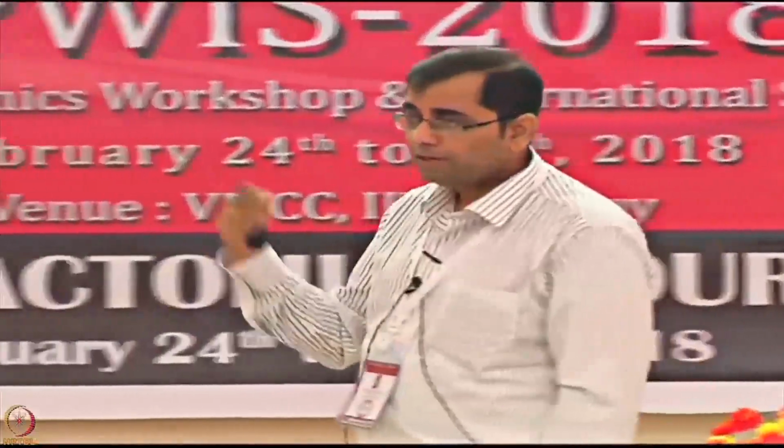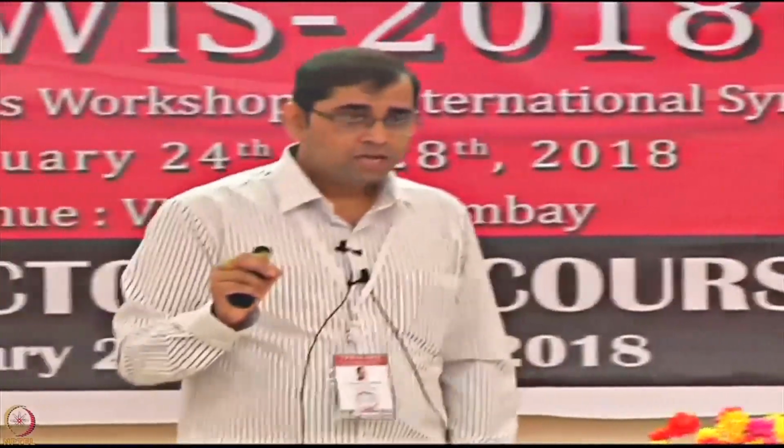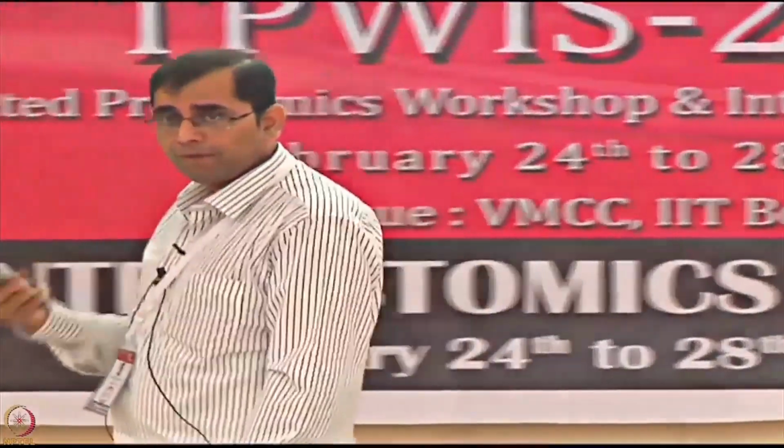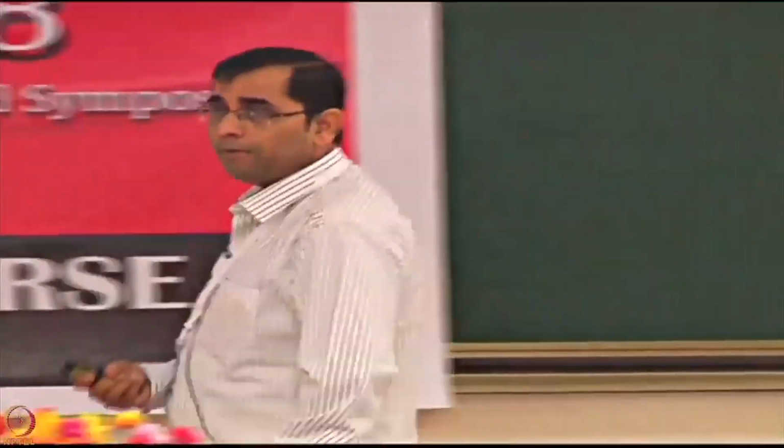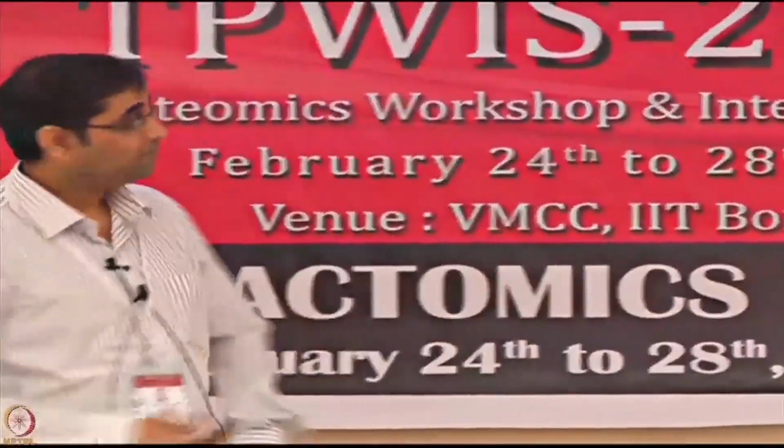And that's where people in the Josh lab are now following up the work. They are building a new type of SPR platform where HaloTag-based chemistry could be used with the chloroalkanes, and then probably that will have much more robust signals, which is what is required for low-abundance proteins in the clinical sample context. So this is how technology development takes place. This is one of the approaches you can appreciate could be used for high-throughput screening, which I'm sure will eventually come to the market.